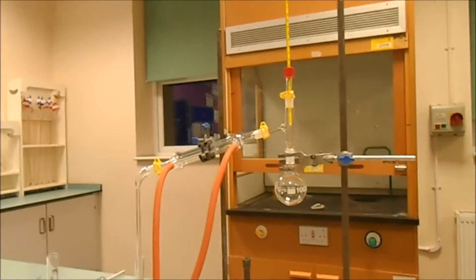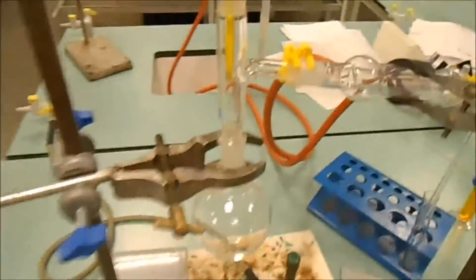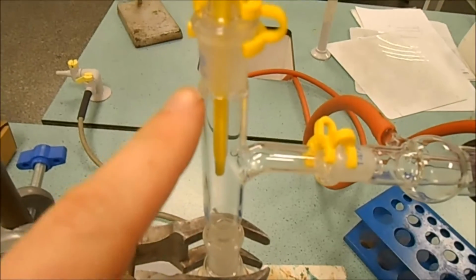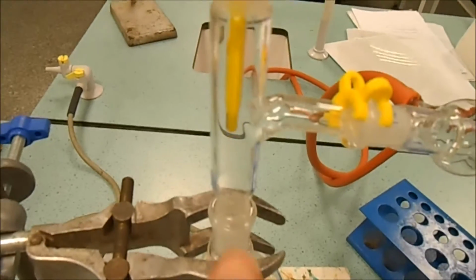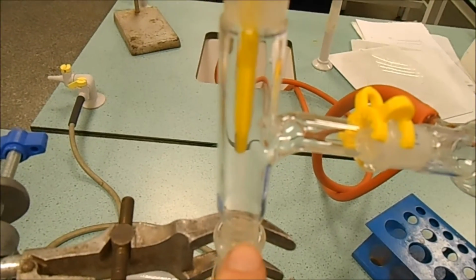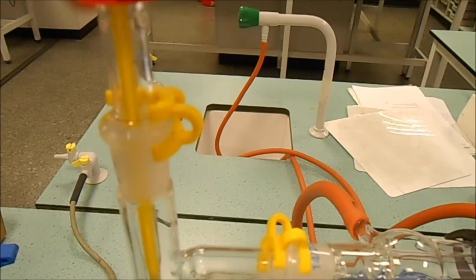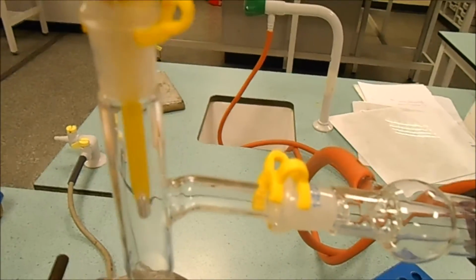So what we want to do is we want to take our distillation apparatus. We've got a round bottom flask here. We've got a still head, which is this three-piece thing here. That's clipped here and here. Now it's not clipped here because the clips tend to melt if you put one there. Thermometer here is really important. Okay, without the thermometer, this is not going to go well.